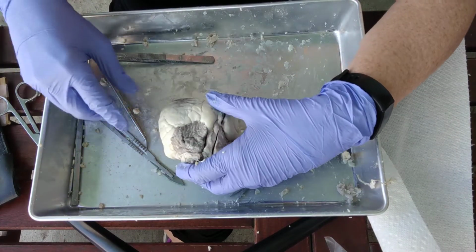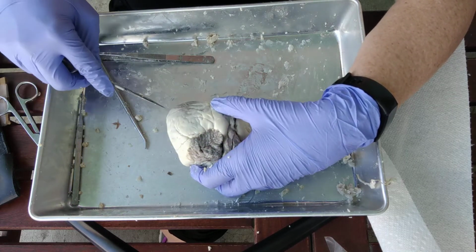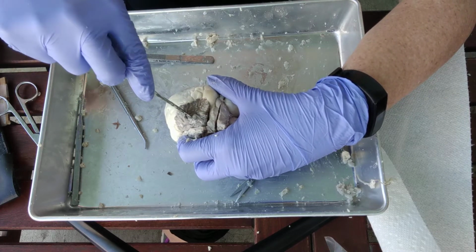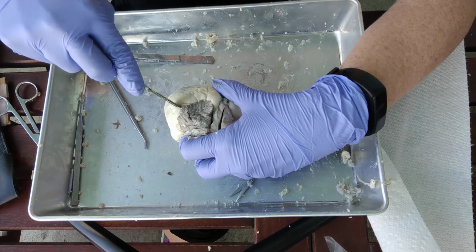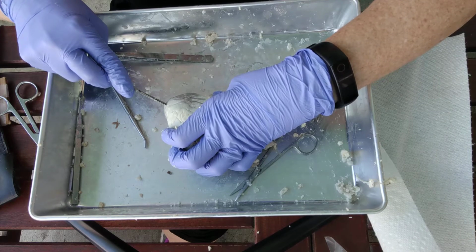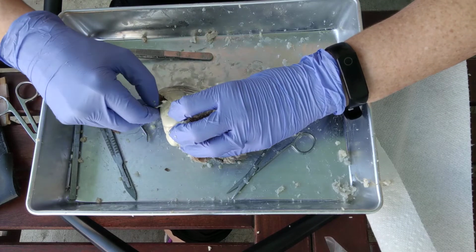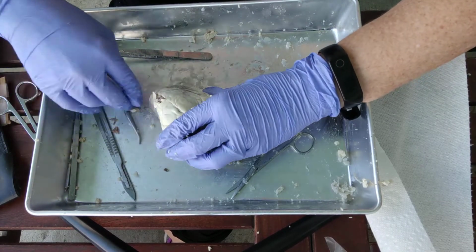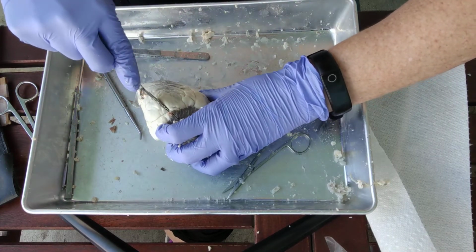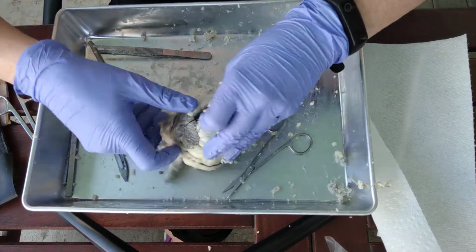Okay, so now we're ready to go ahead and cut on the left side here. So we're just going to make one straight cut all the way from the top to the apex at the bottom. We'll cut through the left atrium into the left ventricle. Now this is going to take some strength because that muscle is really thick, and I'll show you the difference. Ooh, a whole bunch of fat just fell off there. Okay, so it might take a couple of cuts to make it all the way through. Just keep cutting until you get there, and it should open up like a book.